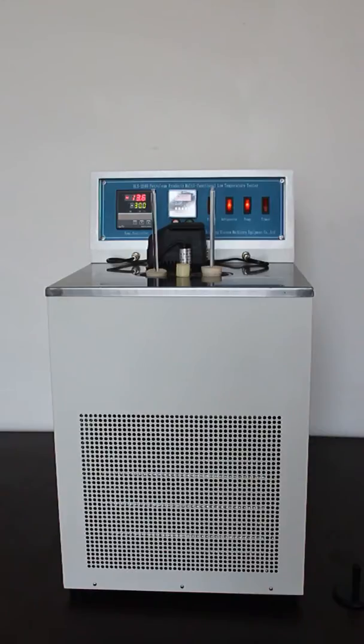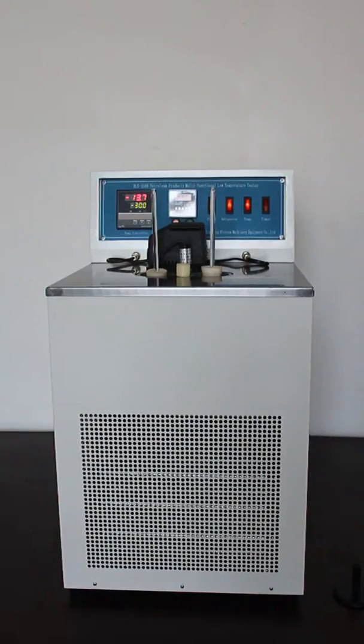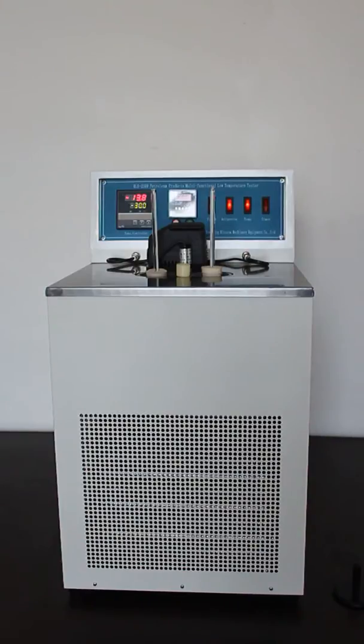Pour point is tested at every 3 degree C interval. Cloud point is tested at every 1 degree C interval.